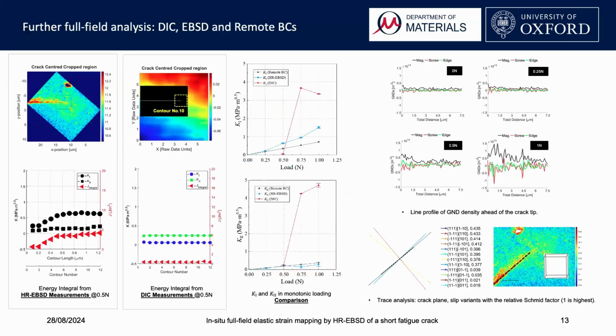As an additional note, we also did J-integral analysis with the DIC obtained data, and you can see a sharp rise in the DIC results, which further confirms the plastic deformation happening ahead of the crack tip. And this was further confirmed by the GND analysis.